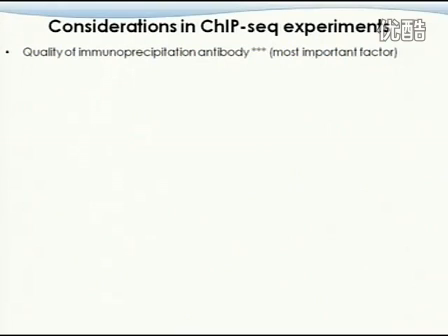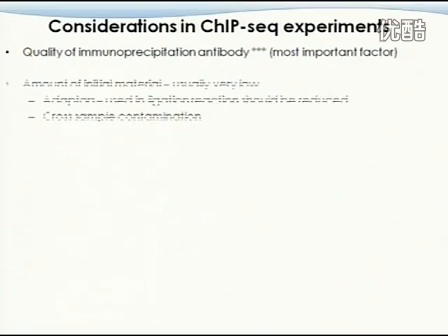And if you want to test the assay before you go to the sequencing, you probably need a few positive regions. You run qPCR after immunoprecipitation to see whether there are really positive signals, and then you put your samples on the sequencer to go to larger scale. But the point here is antibody is really, really important.